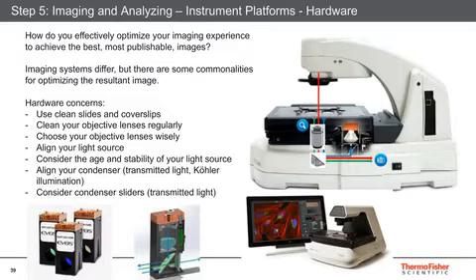And you have built into this light cube the excitation and emission filters for that family of dyes. For instance, a GFP light cube will have those filters for GFP or fluorescein. This is an inverted microscope, so you can see that it's the opposite of the scope I showed before, where all of the fluorescence is down below in the bottom, going up to your sample and back down to the camera. Notice there's no eyepieces, so you're imaging through the monitor. At the top is one of our EVOS FL Auto automated microscopes, and at the bottom there is our brand new FL Auto 2, the newer version of our automated microscope.